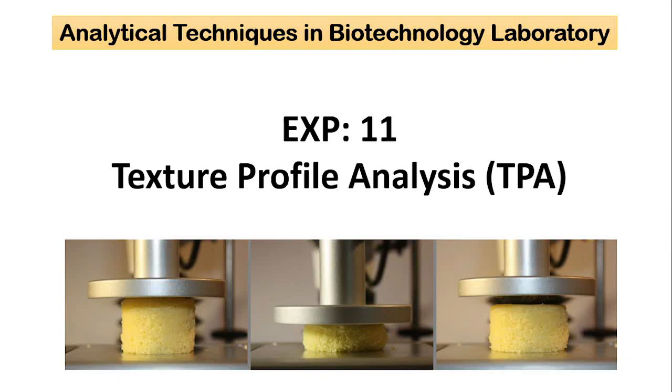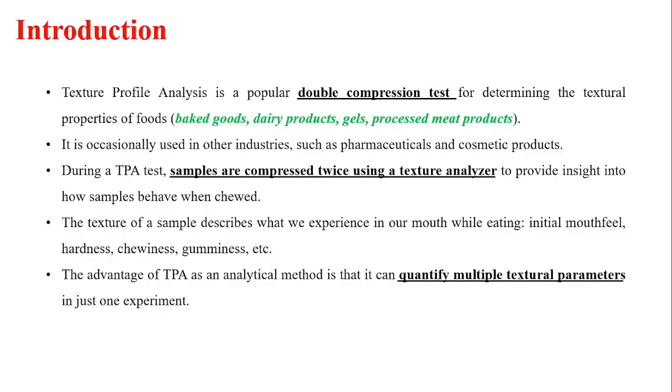Good morning, everyone. Today we'll be studying and demonstrating texture profile analysis. It is another test that we do using a texture analyzer. Texture describes what we experience in our mouth while eating, such as initial mouthfeel, hardness, adhesiveness, cohesiveness, springiness, etc. This texture is measured by using a texture profile analyzer.